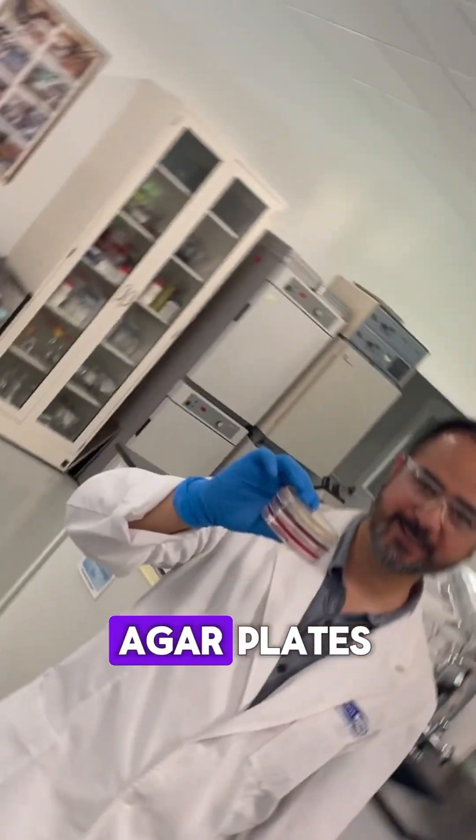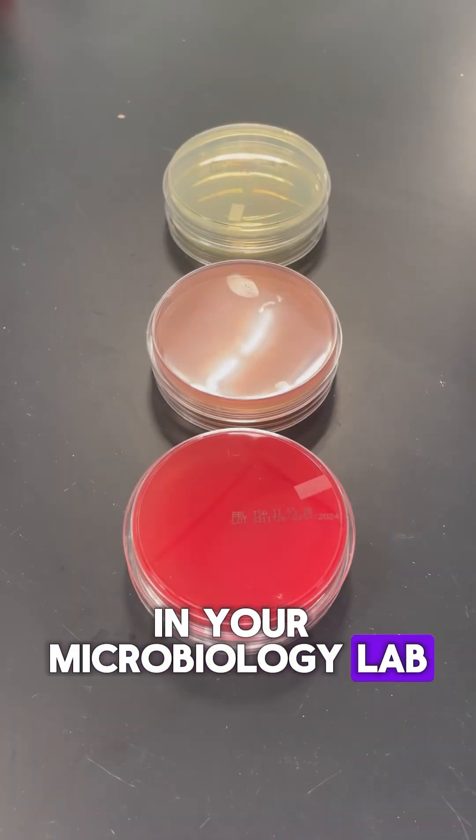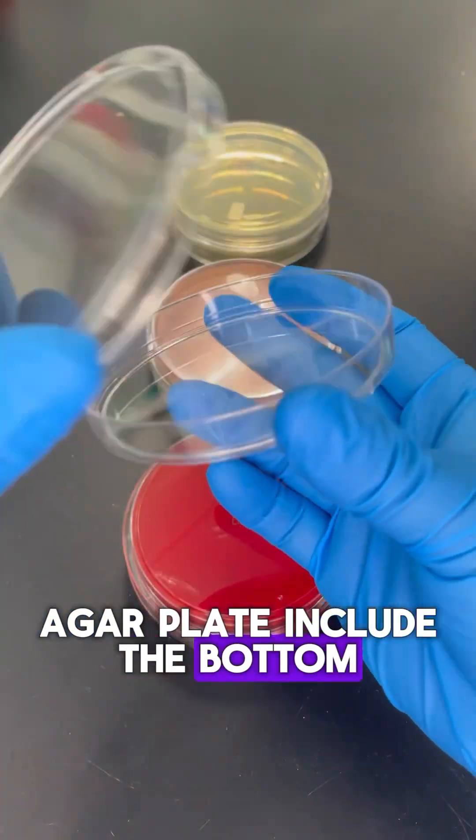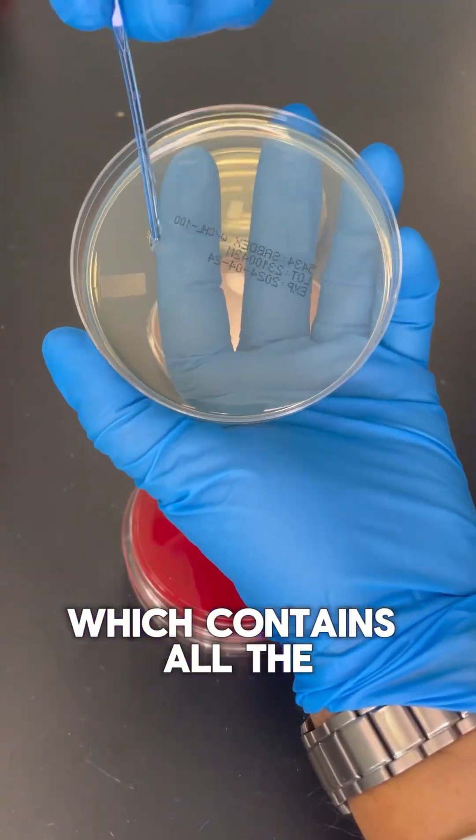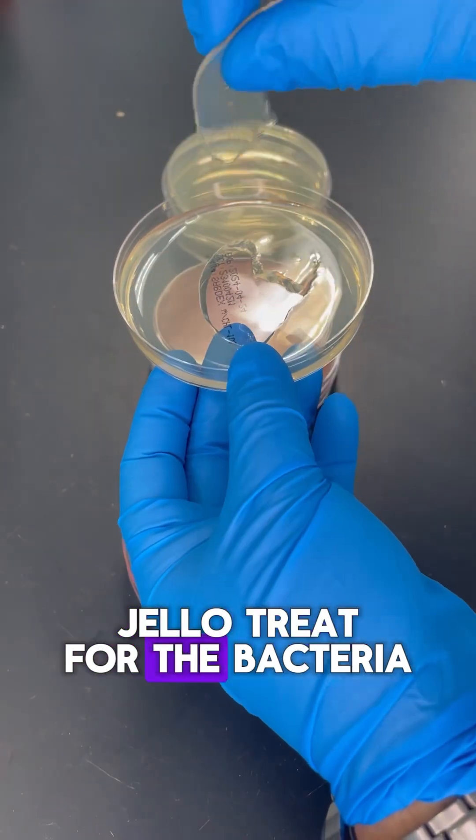Upside down is the proper way to incubate agar plates in your microbiology lab. The parts of an agar plate include the bottom, the lid, and the agar, which contains all the food for the microorganisms. It's like a thick jello treat for the bacteria.